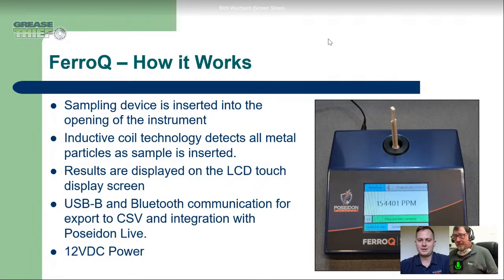Yeah, definitely. I think that's something we're going to come across more and more as we get these on more wind sites. Before, the technician takes the sample and maybe they're not even the one that ever sees the result. It'll be the site manager or the engineering team. So having the ability to see that and track it every day is going to breed accountability and get everybody to take more interest. And like you say, pride in your work, which is great.